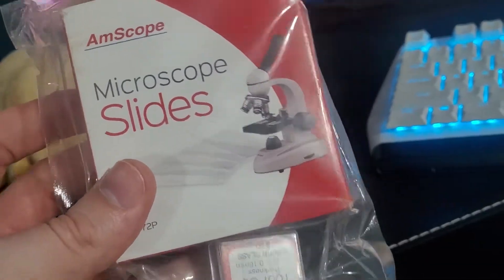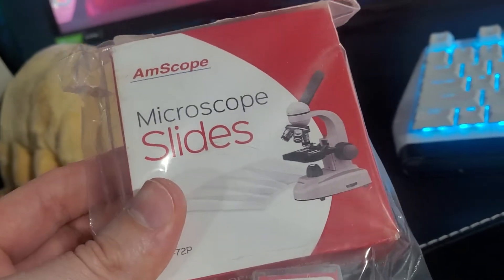I went ahead and got some AM Scope microscope slides as well. This is for if I want to put the tardigrade on there and look at it.